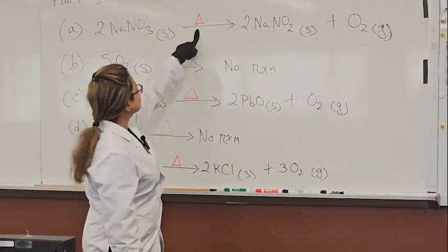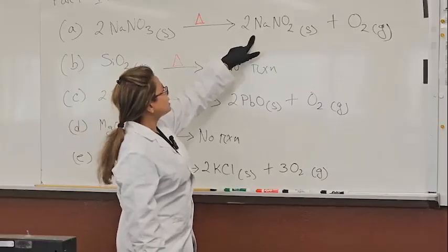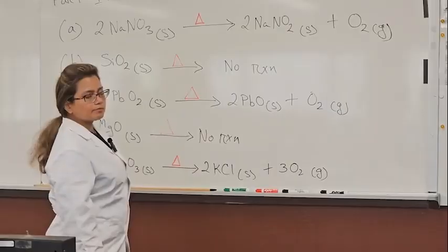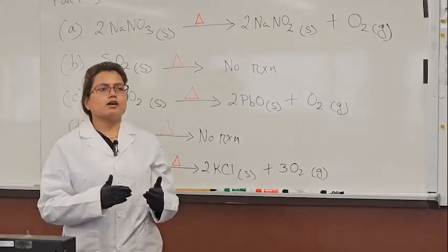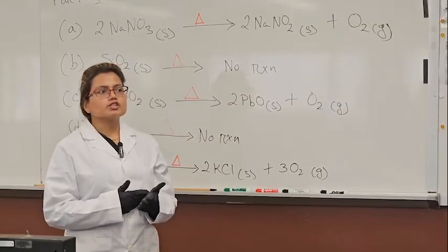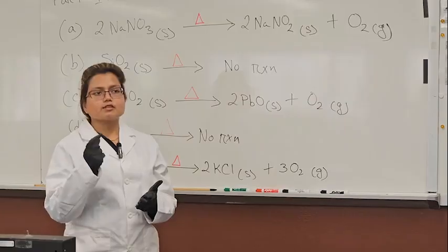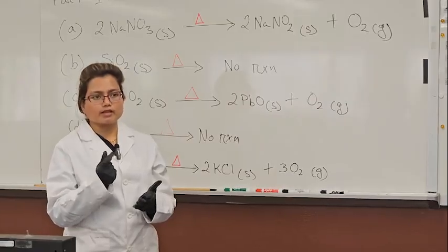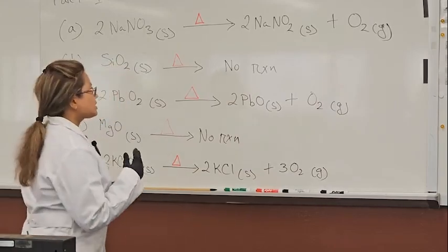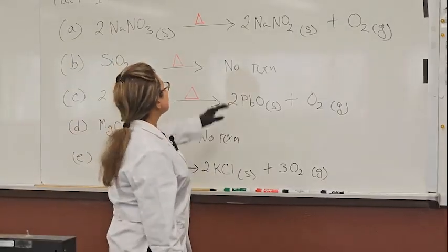What we are going to do is heat the complex compound. This is the cone for heat. We are heating it, and then we will see some chemical change. Chemical change means it may change color, it may change odor, or maybe a precipitate forms, that is, an insoluble solid. It may also produce some bubbles. If you see those kinds of changes, it means there has been a chemical change.